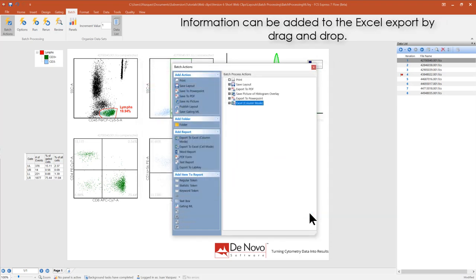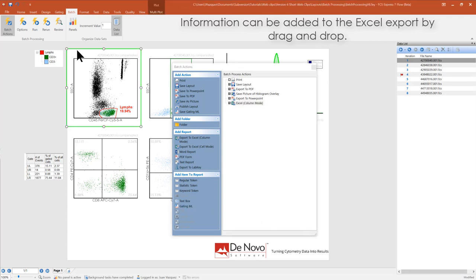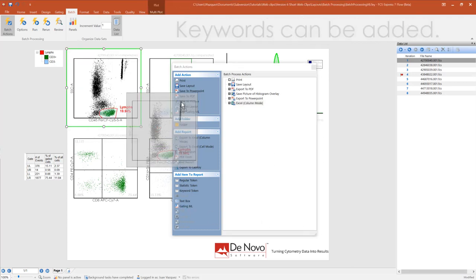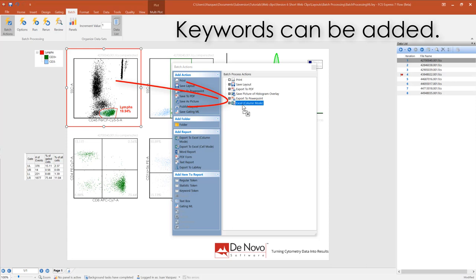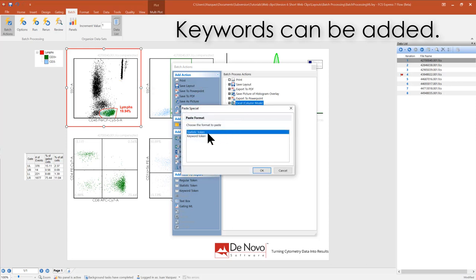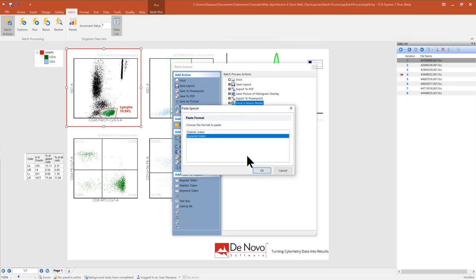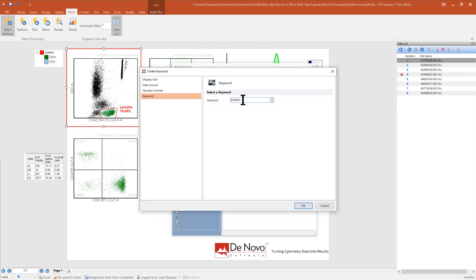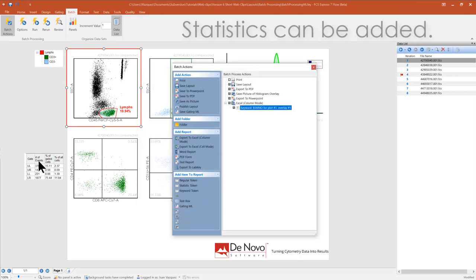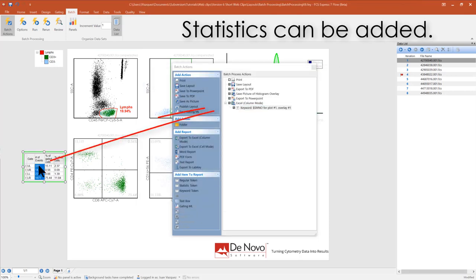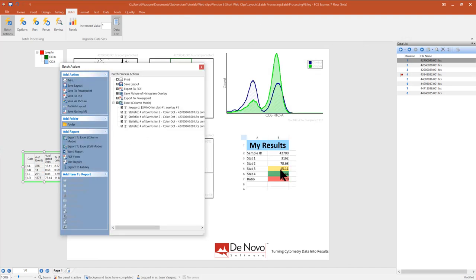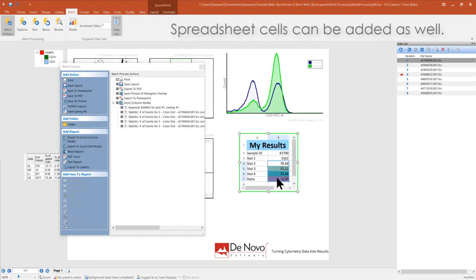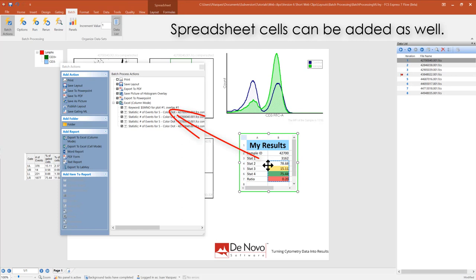Information can be added to the Excel export by drag and drop. Keywords can be added. Statistics can also be added. Spreadsheet cells can be added as well.